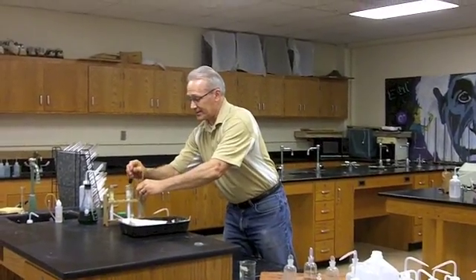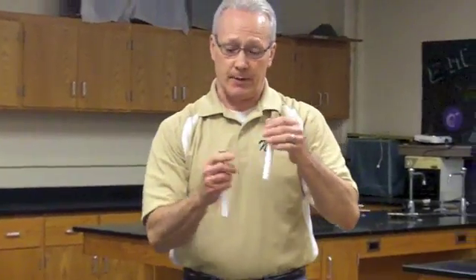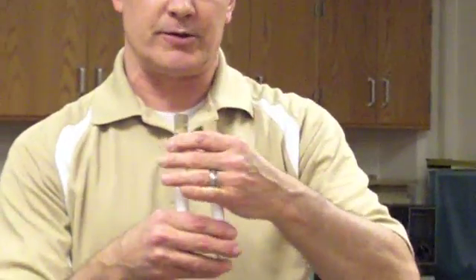Now what you want to then do is go back to the booklet and find out which carbonate you have. And what the tests say to do is to get a known carbonate, a hydrogen carbonate, and your unknown, and get 3 separate tubes. Dissolve them in water. You'll then get hydrion paper and test the pH of all 3 of those. Yours should match the pH of one of these 2 solutions. And that's how you determine which carbonate you have.